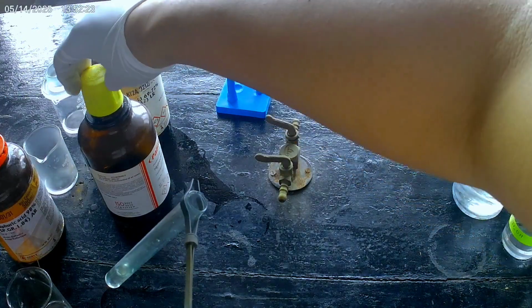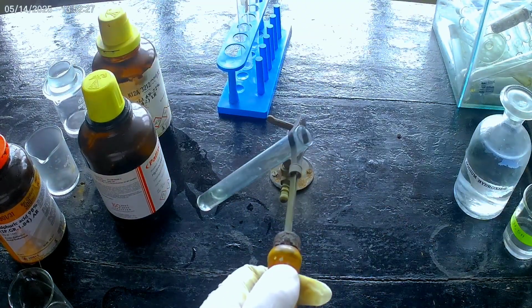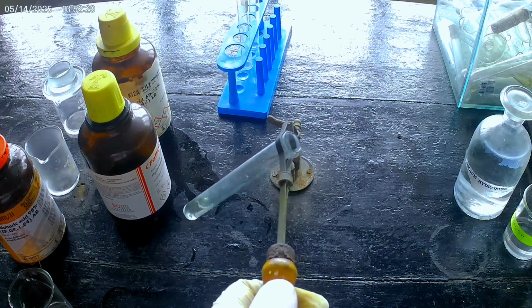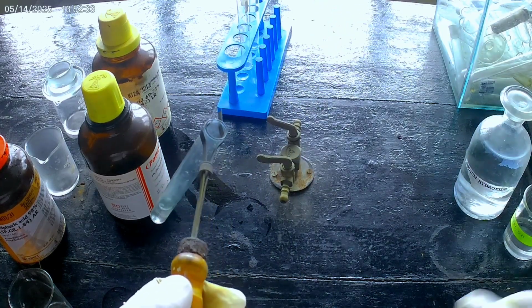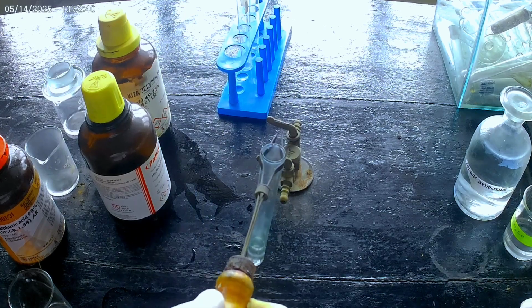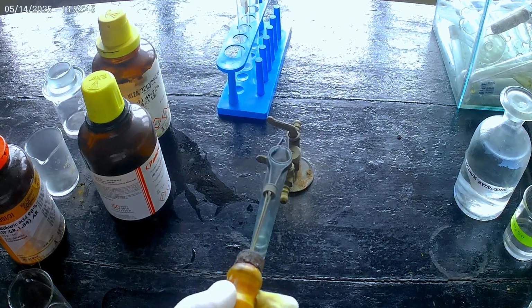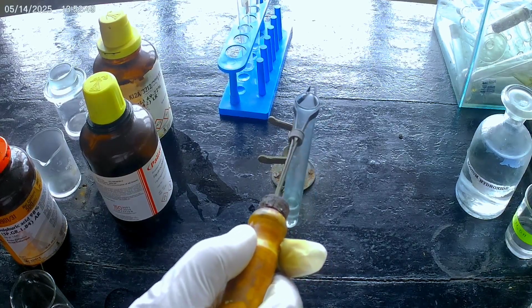And let me put the cap. Since it's a volatile acid, it vaporizes. Now next I'm going to take a metal, zinc. This is zinc metal, it's hard. Now see what happens. One small pellet of this zinc metal, and let us see.